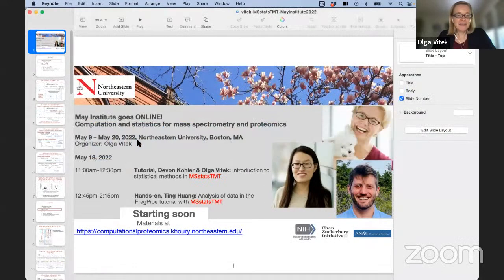So then let me go ahead and share my screen, and we will go back to statistical methods, and we will talk about statistical methods specifically implemented in MSstatsTMT.